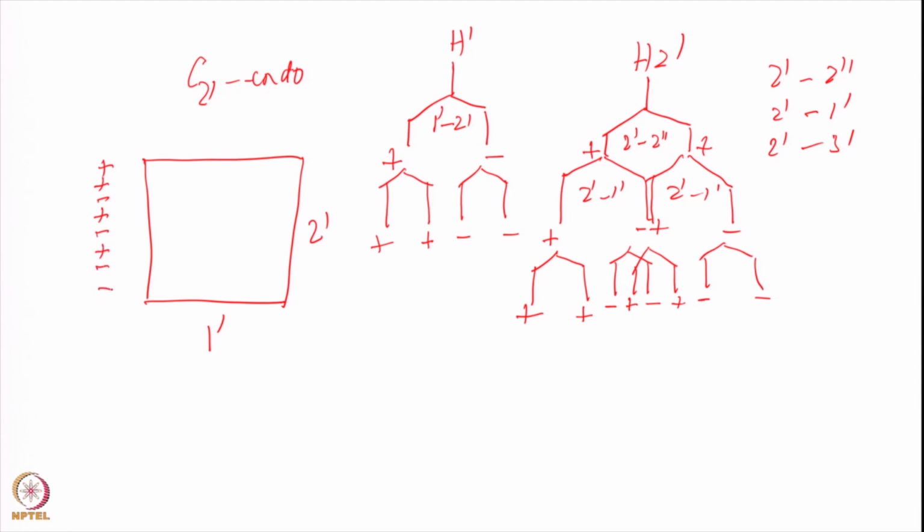And this side I have here plus, minus. So we put that here, plus, minus, plus, minus, plus, minus, minus, plus, minus, minus, plus. So you will have 32 components, and all of these couplings will of course have the separation there as we indicated here.